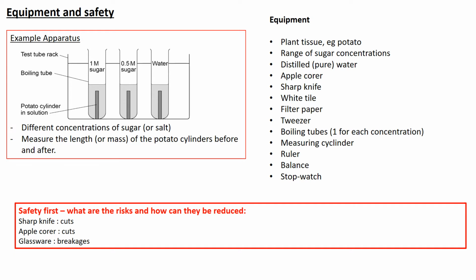A sharp knife, also known as a scalpel. White tile for cutting on. Filter paper, tweezers, boiling tubes, measuring cylinders, ruler, balance, fancy word for scales, and stopwatch.